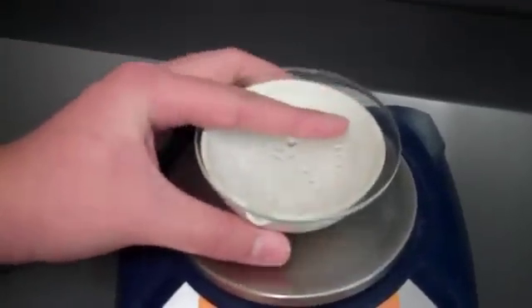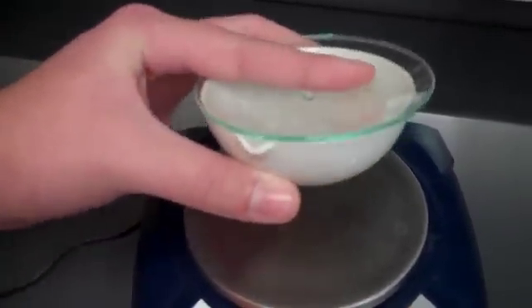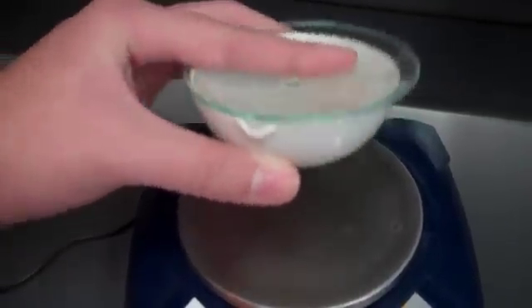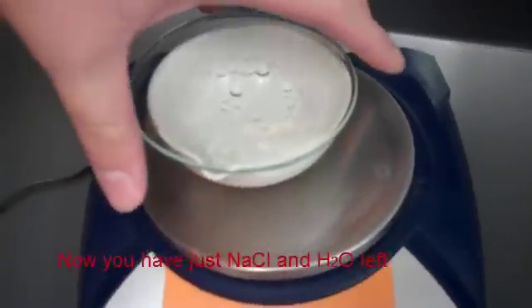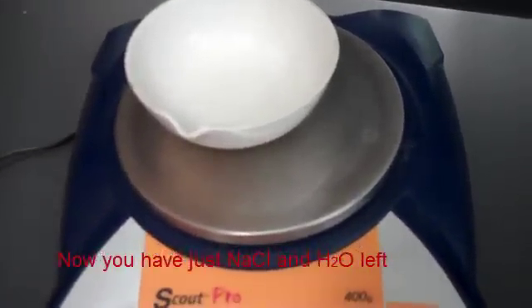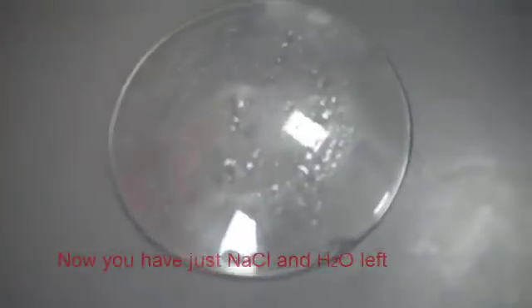Now carefully tilt the evaporating dish back and forth so that all the hydrochloric acid touches all of the rest of the evaporating zone. Make sure all the bubbling has stopped. Then place the watch glass curve side down on the evaporating dish.